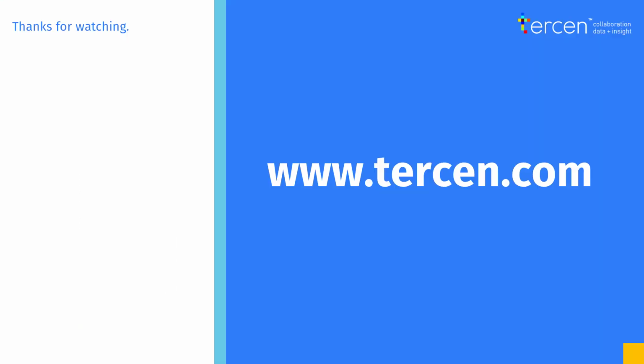So, hopefully this video has given you a brief look at how you can transform your data analysis. We would like to encourage you to sign up and see for yourself. Tercen is free for the individual user, so there's really nothing to lose. And there are many more great features that I haven't covered here.